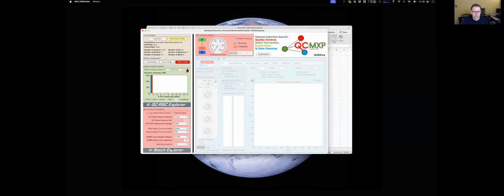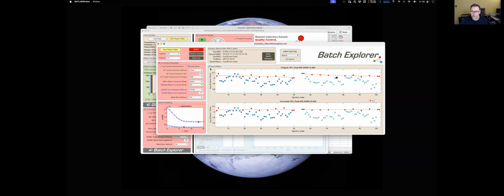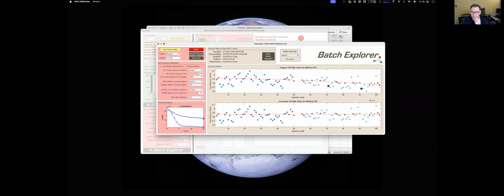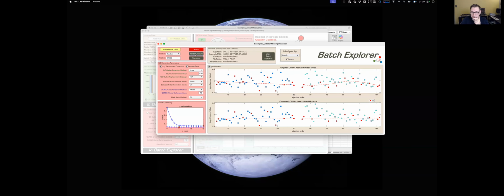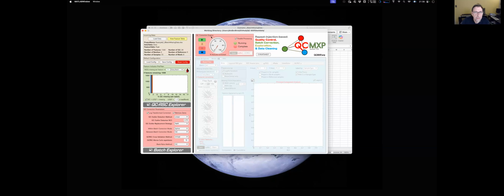And then the last thing you do before you run it across the whole data set is look at it across the multiple batches. And you can see here, again, the same algorithm configuration, but now we're correcting 2 batches. You can see how it's correcting those 2 together and aligning them across. First it's doing the within batch correction, and then it's doing the between batch correction. So right now we basically run that algorithm across all the features across the within and between batches.